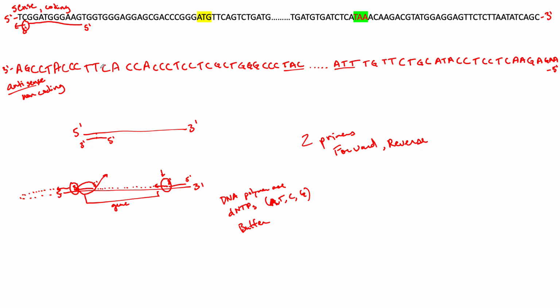strand. All right. You've read in your manual some of the other requirements for primers, but this is the big one. To make your primer copy the gene, the forward primer needs to anneal to the antisense strand. You read in your book that primers are generally 18 to 30 bases long.